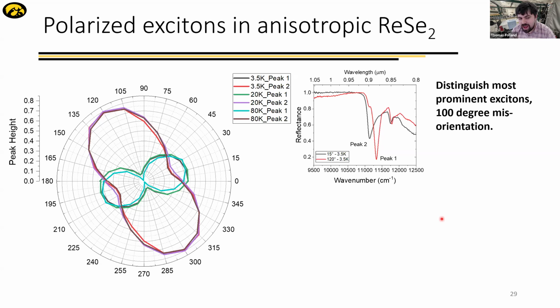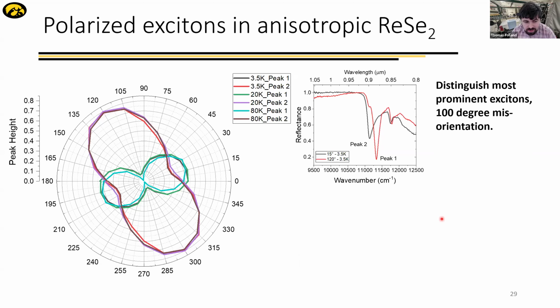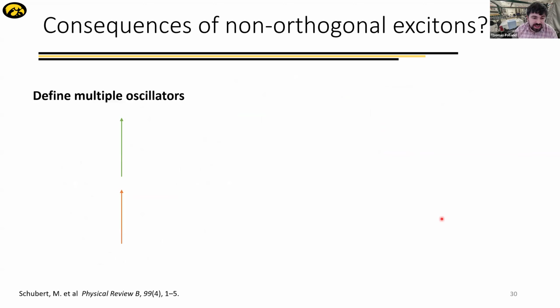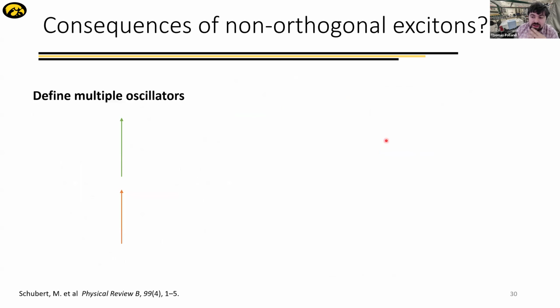And if we have excitons that are non-orthogonal, you can ask the question, what kind of polariton might form in there? We've done some work on looking at this in other low symmetry materials, but before you get anywhere, as I said, you need an optical model. So you need to fit to the data we've collected here in order to figure out what the anisotropy is.